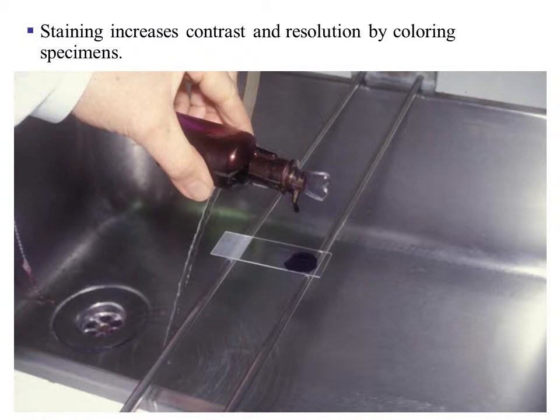Staining a bacteria or any cell is going to increase contrast and resolution. This is going to be achieved by differences in structures which can be observed by coloring.